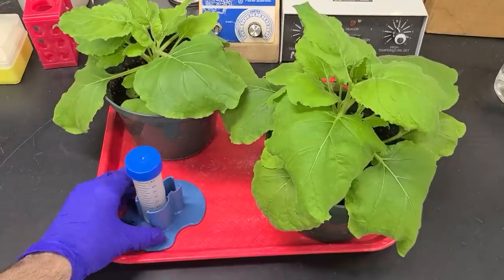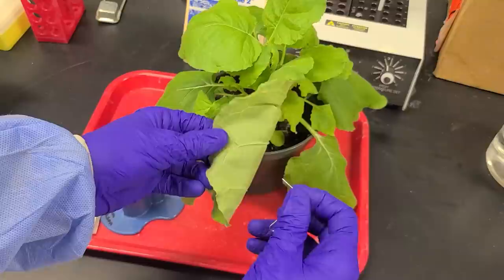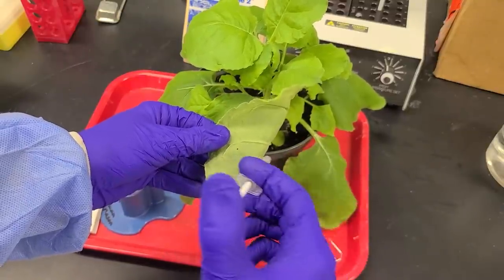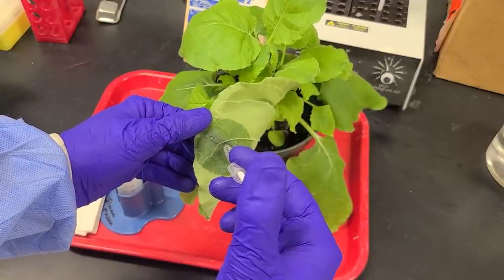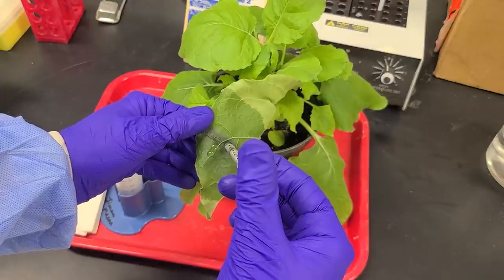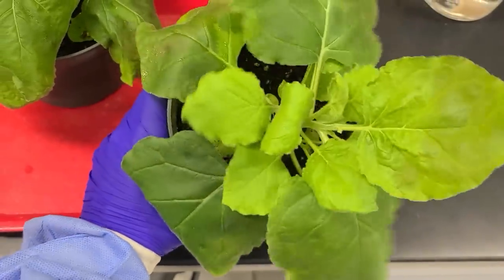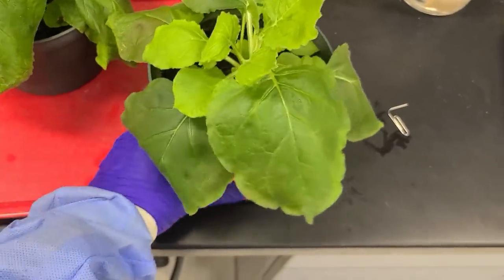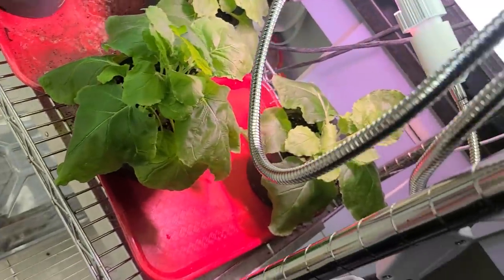It's plant time. All right, I'm going to suck up some of that bacteria. I'm going to make a tiny little prick on the back of the leaf with a paper clip, and then inject it in. Yeah, cool. All right, now all the leaves have been injected, so these just need to go grow for a couple of days. Come back and get these in a couple of days.